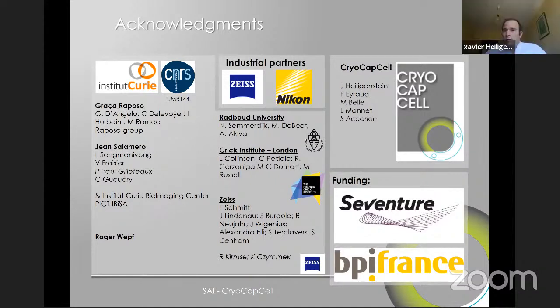So it depends on the workflow you select. In my case, in the correlative HPF, I'm using the Cryo Capsule. And as I mentioned, the Cryo Capsule is a small Petri dish, but has carbon landmarks at the bottom that will tell you you're in A, B, C, D. And that will allow you to see the sample alive and know where it is. So it's, let's say, in A2. And then you freeze, and then the carbon landmarks are transferred in the plastic, so you can find your cells of interest back. This is with the workflow I'm presenting from Cryo Capsule.